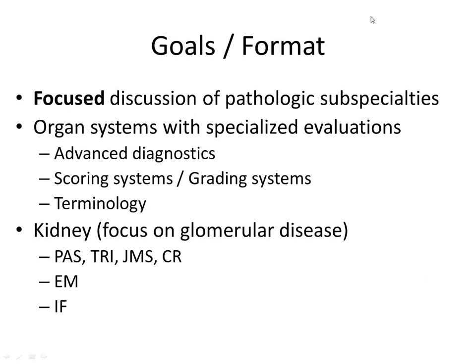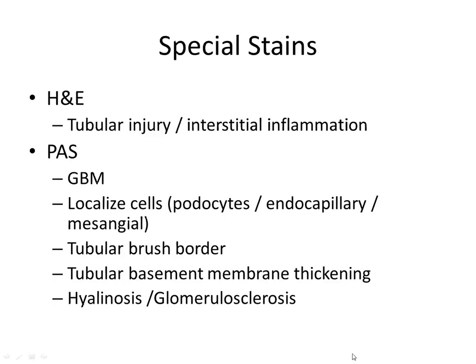So that being said, I have a very quick set of PowerPoint slides just for people who don't have routine special stains for their kidney evaluations. All of this will be available for you on Dropbox at the end of this session. The first question is, why do you do all these extra steps?